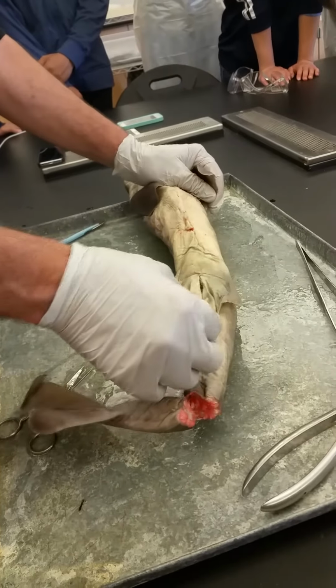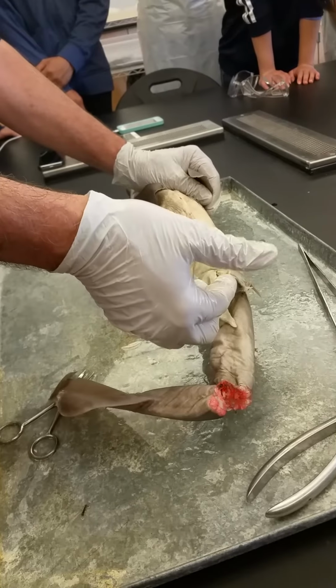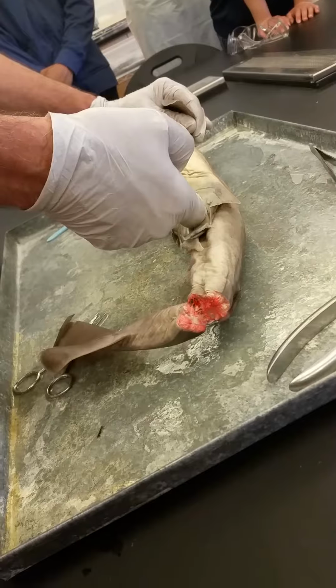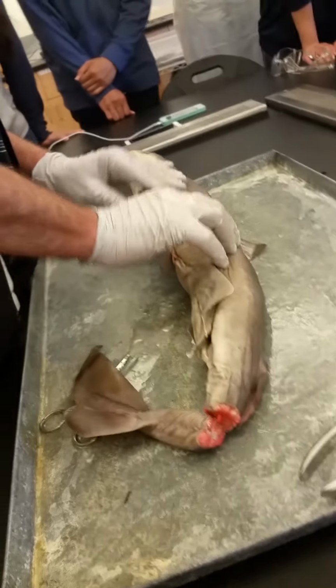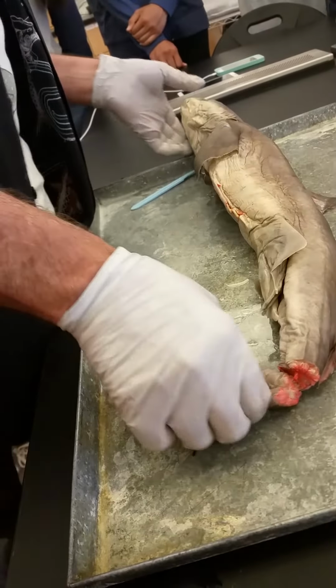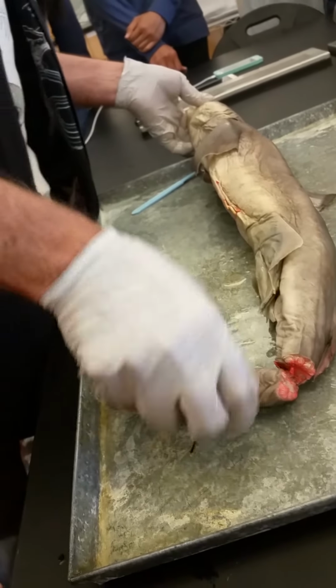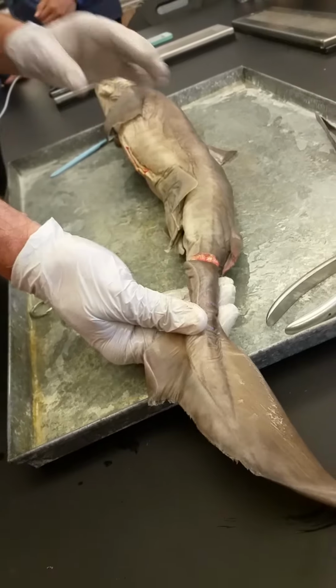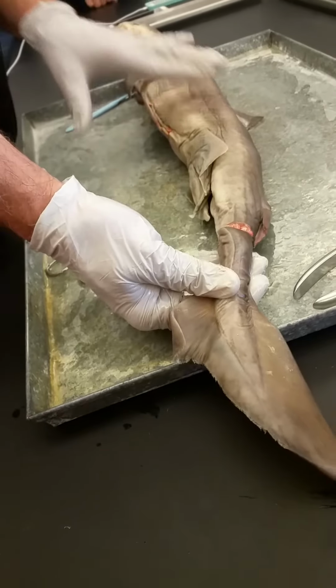So you can tell a shark male or female. Obviously a male has claspers. The female would have the pelvic fin, but no clasper. Anything else on the outside before we go in? Again, the asymmetrical tail. And most sharks would have an anal fin. This particular family does not.